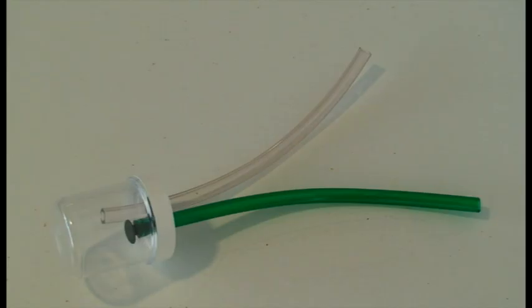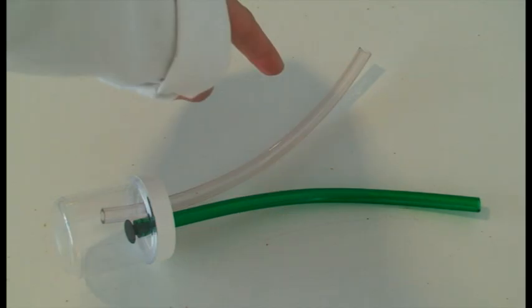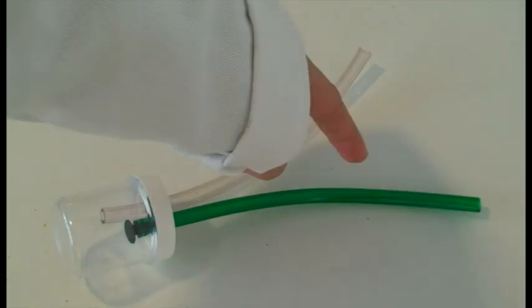A pooter is a piece of equipment that allows collection of small creatures sometimes known as mini-beasts. A pooter looks like this. A pooter consists of a collection vessel, a collecting tube and a short or coloured tube with a piece of muslin or mesh over it. Alternatively this tube will have a plastic stopper in it.